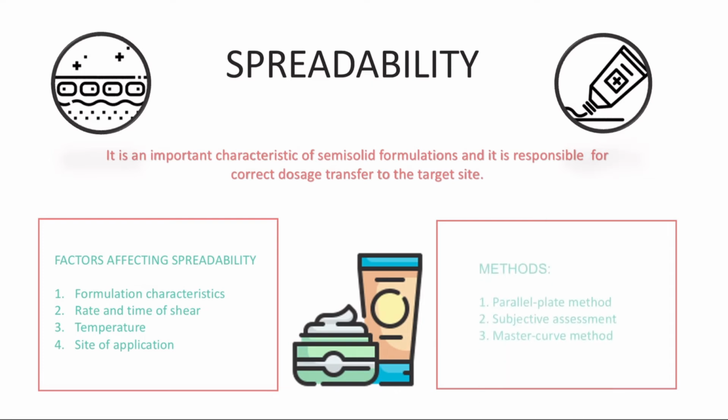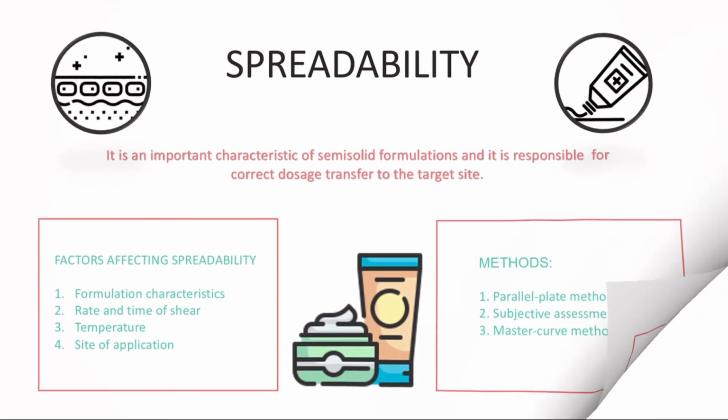There are many methods to measure spreadability, such as the parallel plate method, the subjective assessment, and the master curve method. And we will talk in detail about each one of these methods in the next slides.